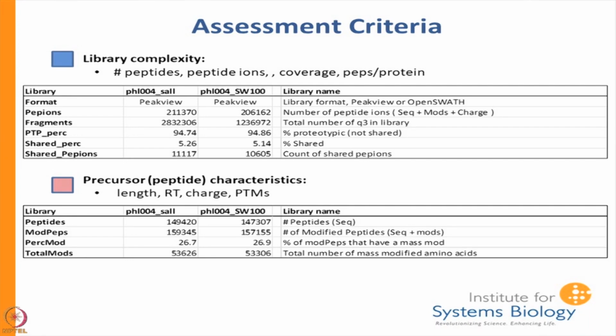This is the number of stripped peptides, we would say, so this is just the number of total peptides. And these two numbers are pretty close. But if you look at this number, 149 up to 211, those are things that we saw, say, both oxidized and unoxidized, or multiple charge states of the same peptide. That's actually pretty common, especially +2 and +3.